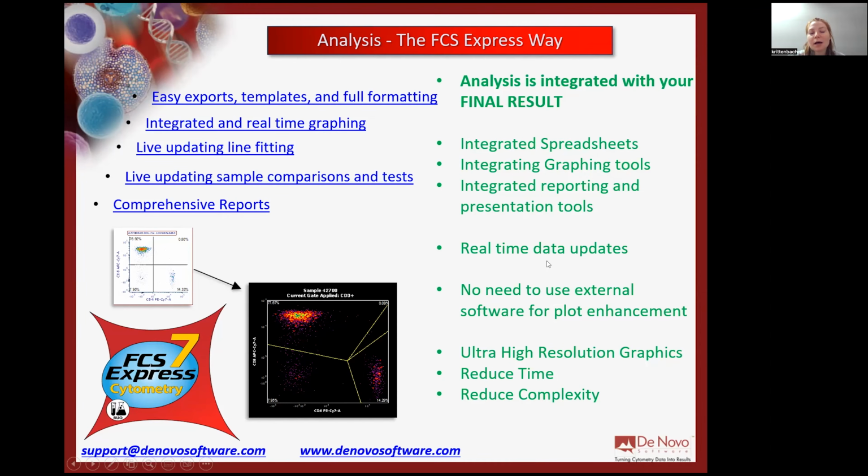When you change something in your layout while you're doing your analysis, your entire layout is going to update in real time automatically. That means all your downstream plots and your downstream statistics will update automatically in real time. You do not need to use external software to enhance your plots and make them look the way that you want. So that means you don't need to use Photoshop. You can make your plots look how you want right within FCS Express.